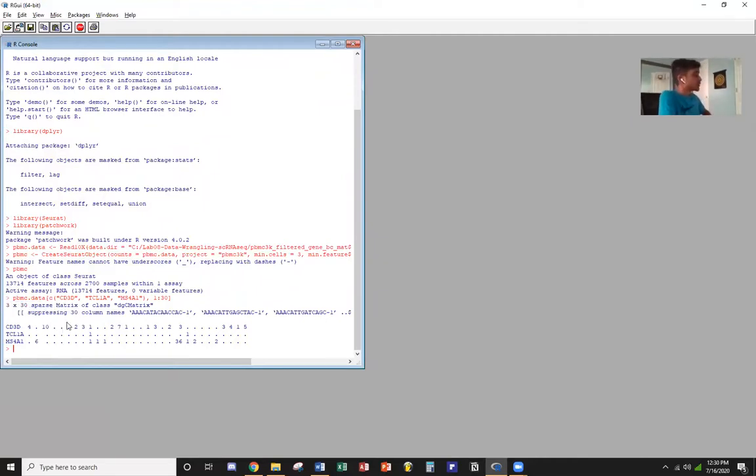This matrix, you'll see the numbers and you'll see the dots. These periods, dots, will be zeros. See, these dots are zeros. This will tell you that there are no molecules there. So no molecules detected. And since most values in a scRNA-seq matrix are zeros, sparse matrix representation is used more frequently. This will save time and memory.